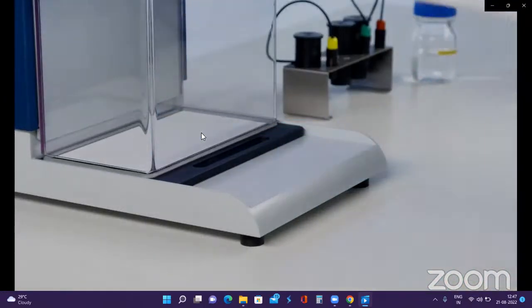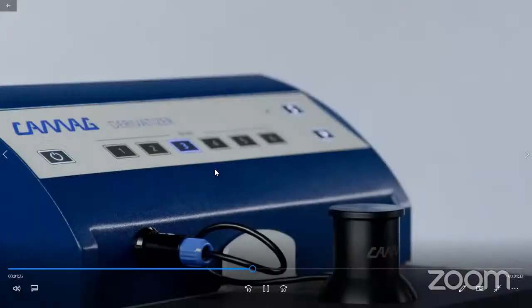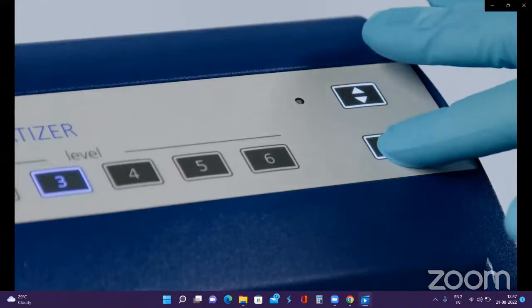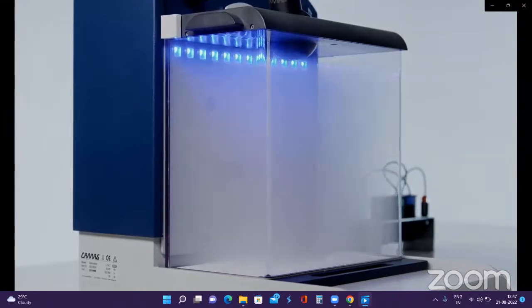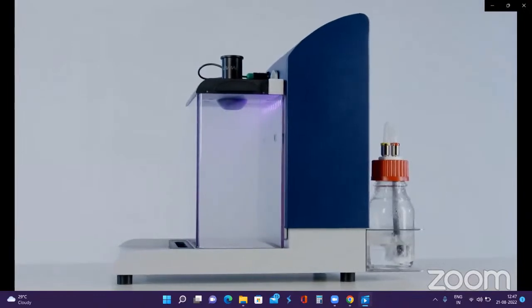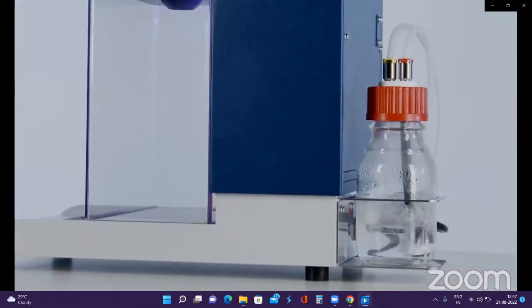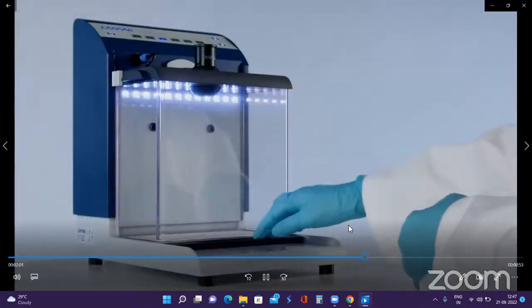After positioning the plate, the hood is lowered and completely sealed to prevent spraying reagent from leaking to the outside. Fill the recommended volume of reagent into the nozzle. The spraying process is started by selecting the spraying level and activating the start button. The nozzle generates an extremely fine reagent mist, which evenly distributes in the hood and gradually condenses on the plate. Reagent remaining in the gas phase is automatically aspirated and collected in the wash bottle. When the spraying process is completed, push the lift button and remove the plate for further processing.